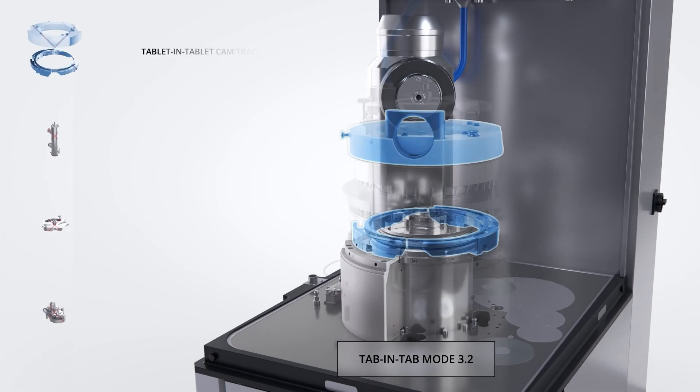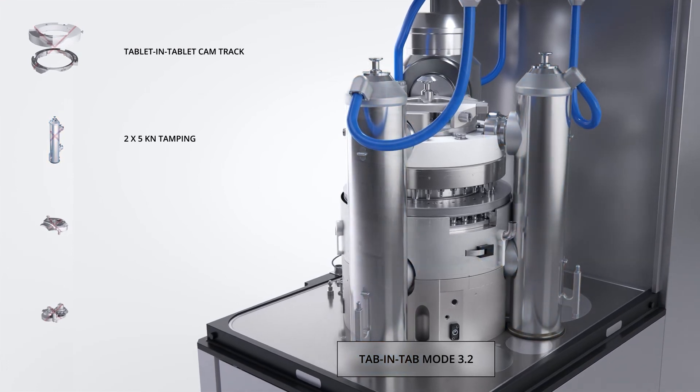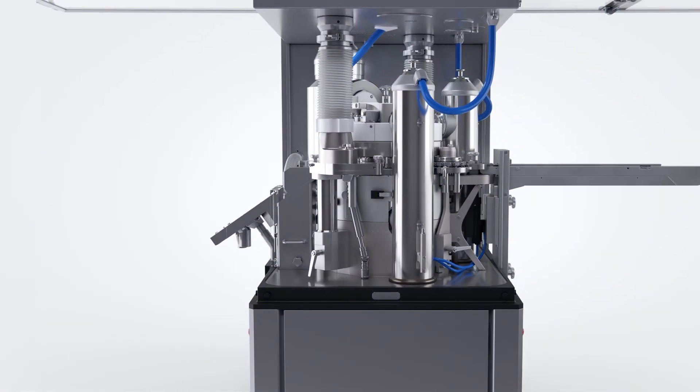Mode 3.2 is ideal for tablet-in-tablet applications or even a microchip inside a tablet. This configuration is similar to tri-layer mode 3.1, but instead of a second layer, an external module conveys a tablet core or a chip on top of the first layer.